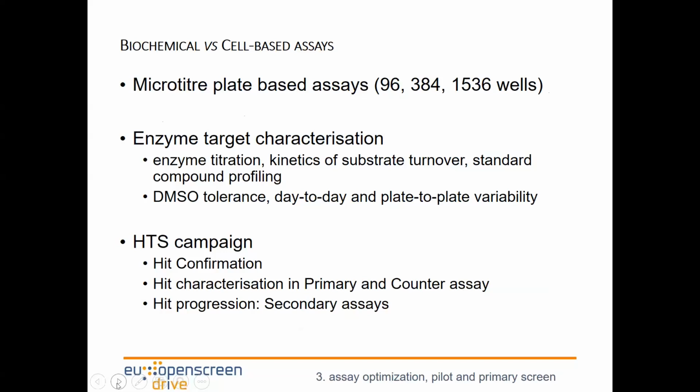And as part of the workflow before we do screening, we ensure that the assay is tolerant to DMSO, as the compounds that we use for screening are often dissolved in DMSO. And as part of the final workflow, we check the day-to-day variability and plate-to-plate variability of the assay. The reference compound, which is used to benchmark an assay, should be consistent within a day and also on a plate-to-plate basis.